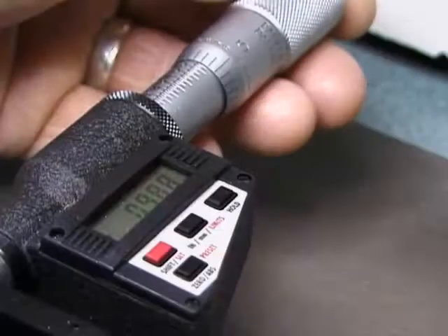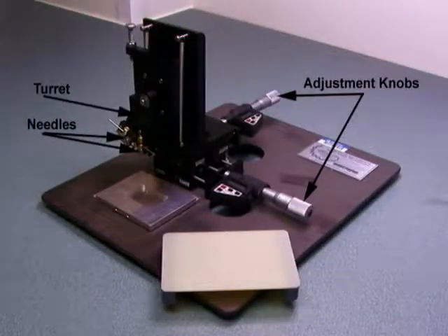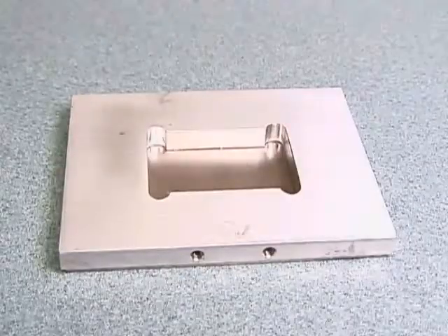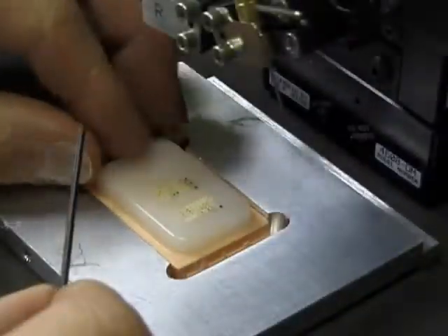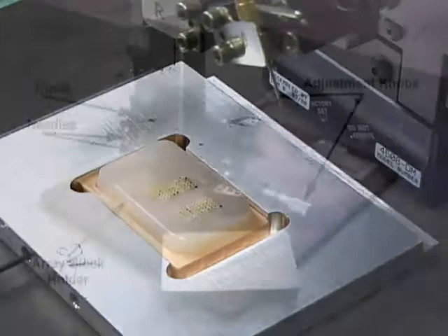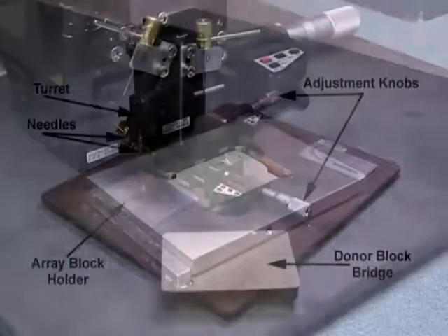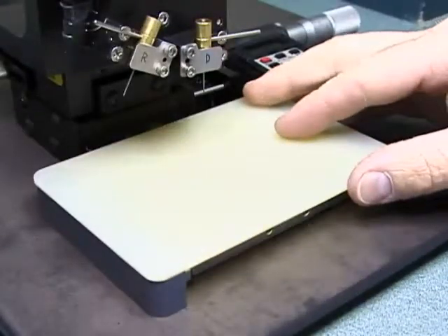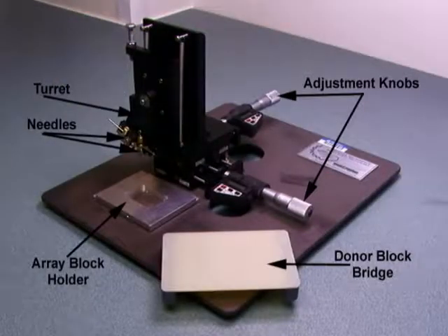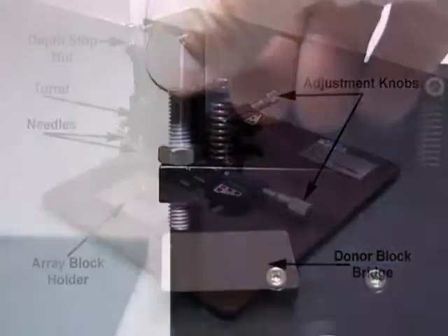The adjustment knobs keep the array punches in precise even rows. The array block holder is where the blank recipient block or array block is secured to the arrayer. The donor block bridge is designed to fit over the array block holder for easy punching of donor tissues. The depth stop is used to adjust how deep the needle goes into the array block.